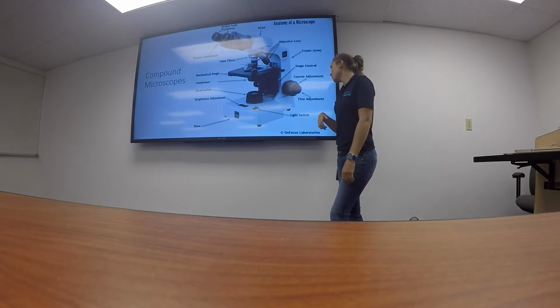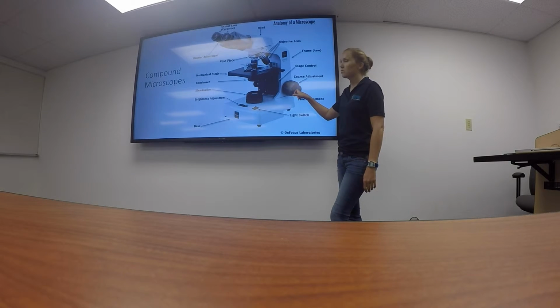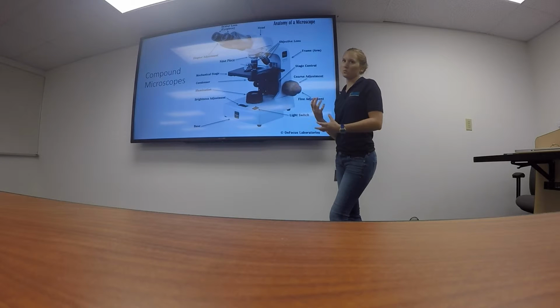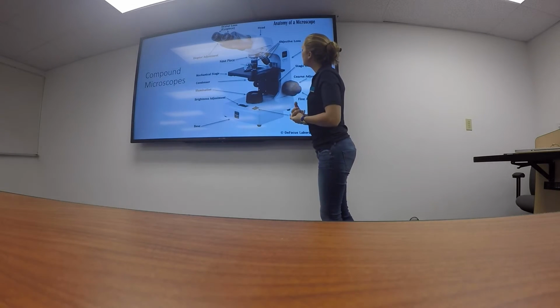It always has a light switch, and it has our coarse and our fine adjustment. Our coarse adjustment moves the stage, and our fine adjustment is really going to give us that clear resolution of the picture. And I think that's it.